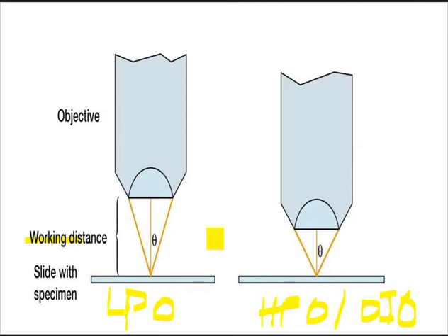So that's why when we use your coarse adjustment knobs, as the name implies, coarse, when you turn it, it moves up and down very quickly. Whereas your fine adjustment knob, its movement is very small.